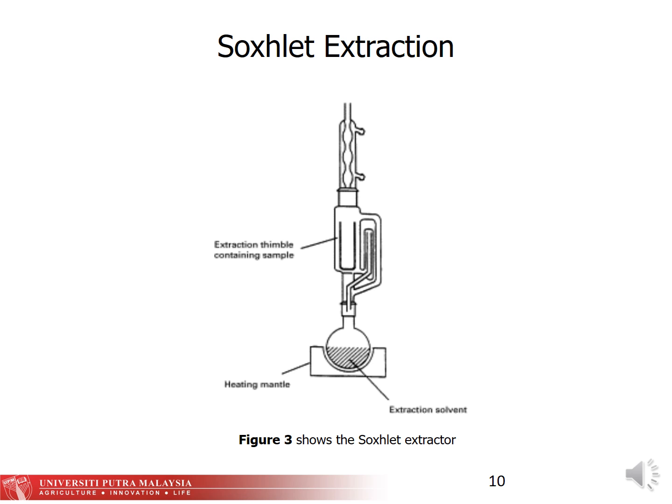Inert gas is applied to the system to prevent oxidation during extraction and to speed up the evaporation and drying process, especially when solvents with high boiling points are used. Soxhlet extraction is preferred when the compound to be extracted has a low solubility towards a specific solvent and the impurities are insoluble in that solvent. Figure 3 shows a conventional Soxhlet extractor. It consists of a condenser, which is the top part, extraction chamber, which is the middle part, and the bottom part is a round bottom flask placed into a heating mantle.